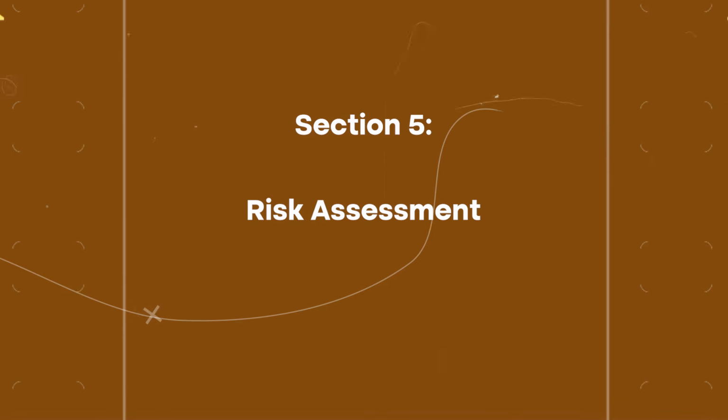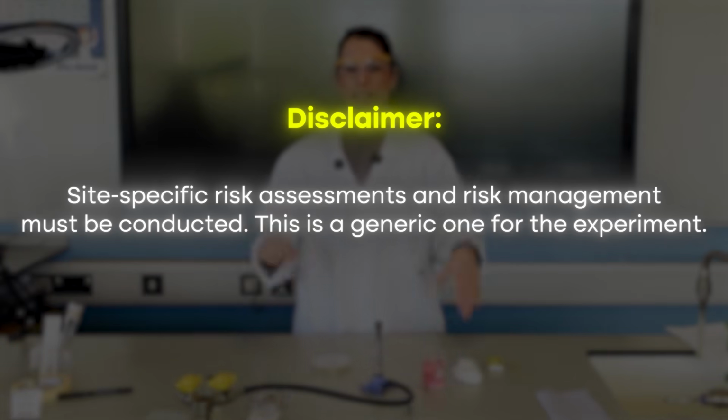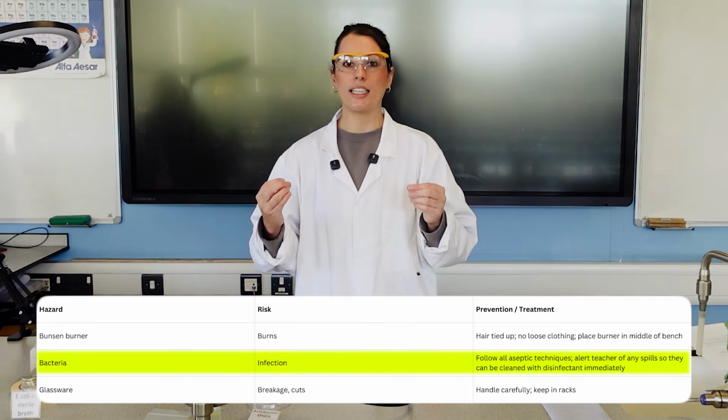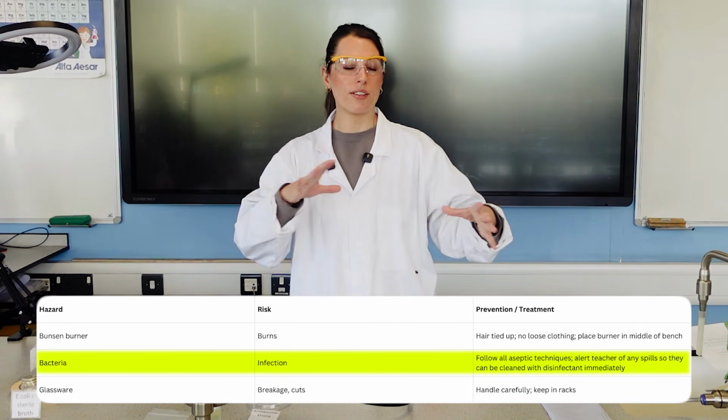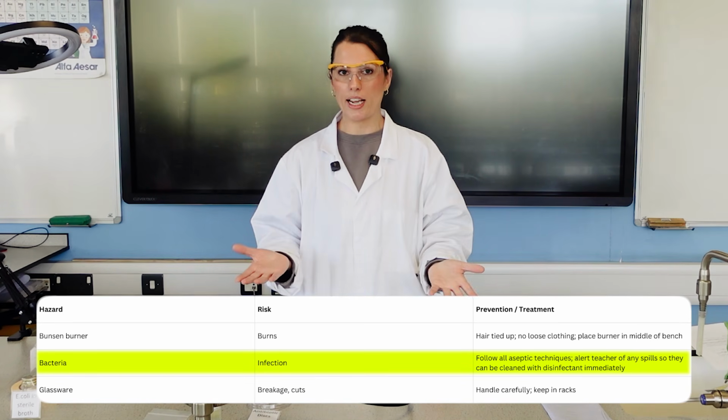So the key risk assessment for the students is mainly what we've gone through with the aseptic technique. So washing your hands with soap, disinfecting the surfaces, because that is now going to be protecting you and other students from transferring any microbes out of the classroom. So they must make sure they wash their hands with soap at the end.